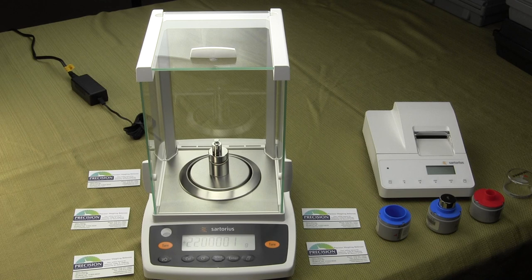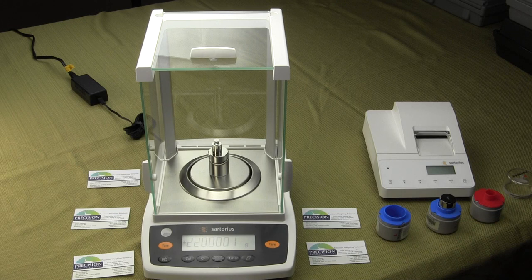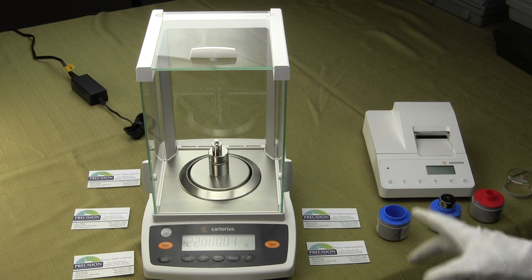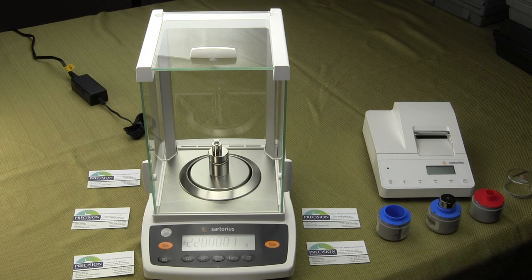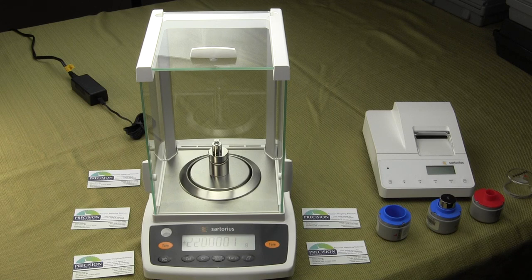As I mentioned, the overlay has changed. On the ED series, it was a white overlay. Now it's a black overlay. Sartorius also has printing on the side of the balance that says this is the Entris series, similar to their Practum and Quintix series.